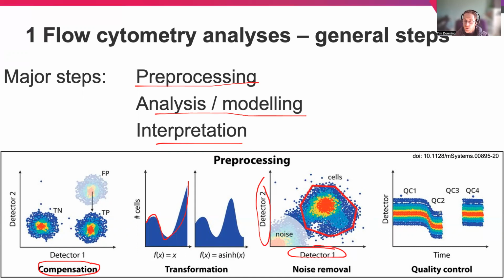And then there's quality control as well, where we want to actually examine the data to see if there's some sort of deviation from certain cell types. Certain experiments would include a control sample within experiments to allow better batch error detection across different samples.